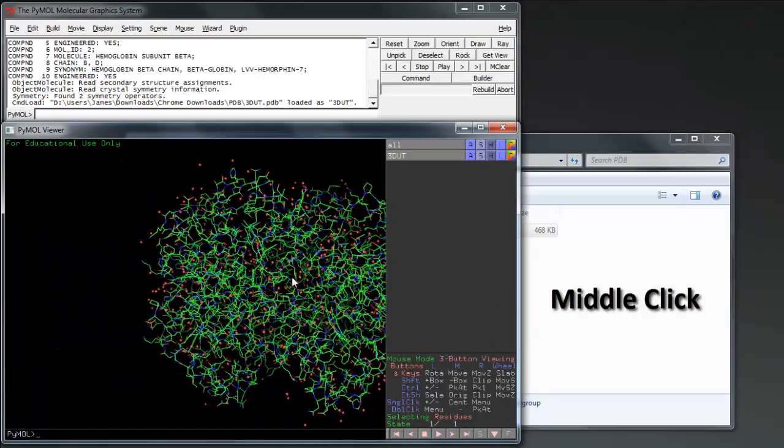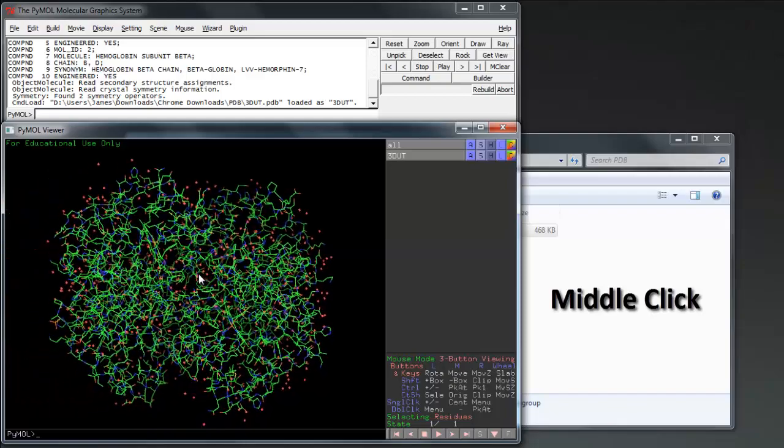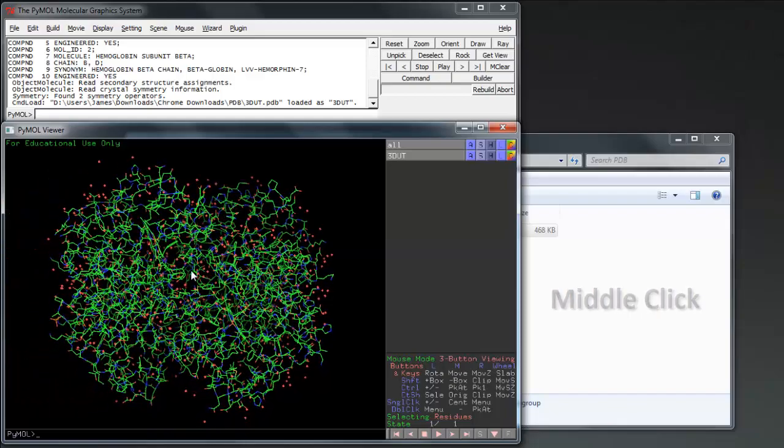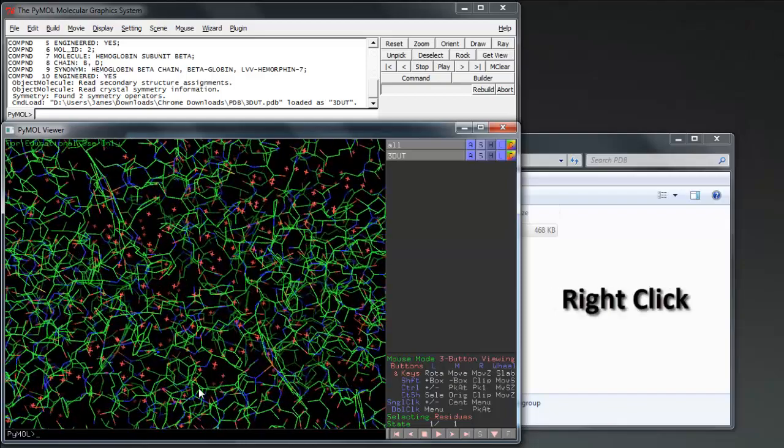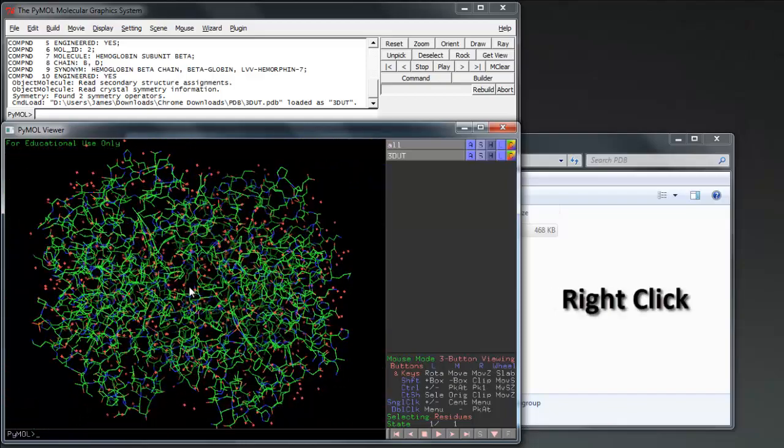Middle-click to move the object, and right-click and drag down or up to zoom in or out.